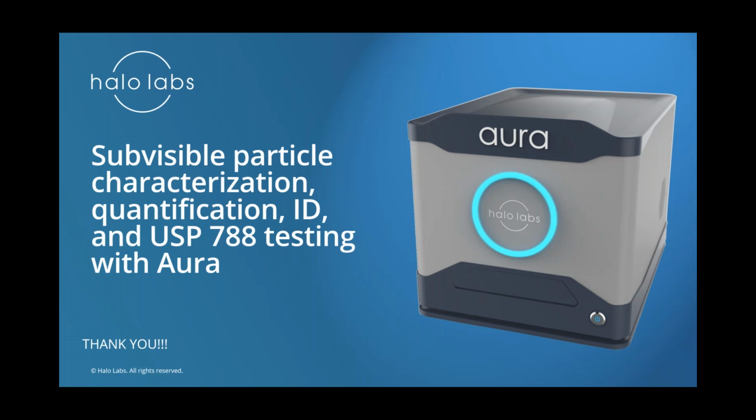And not to give a long-winded answer, but it's also sample dependent. If your sample has lots of large particulates, that changes the equation. But for model samples that are small, 3 million particles per mL. Great, thank you very much.